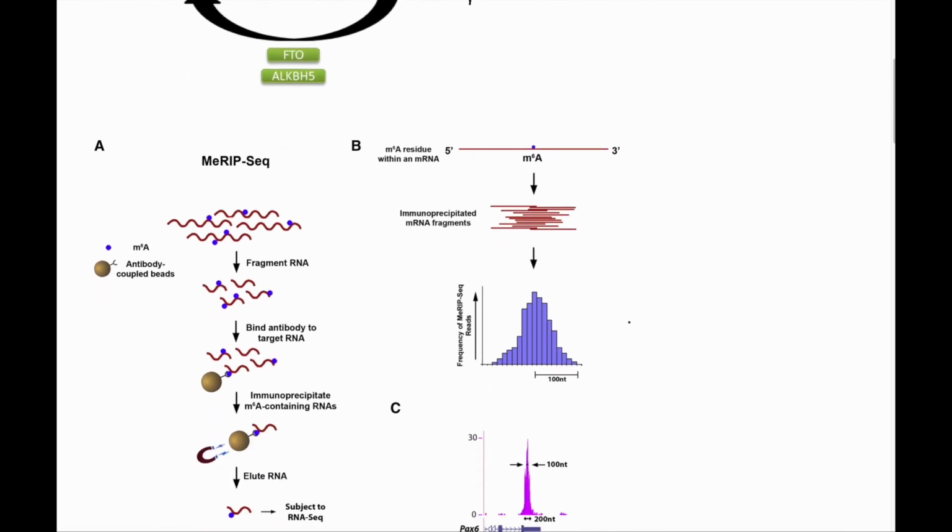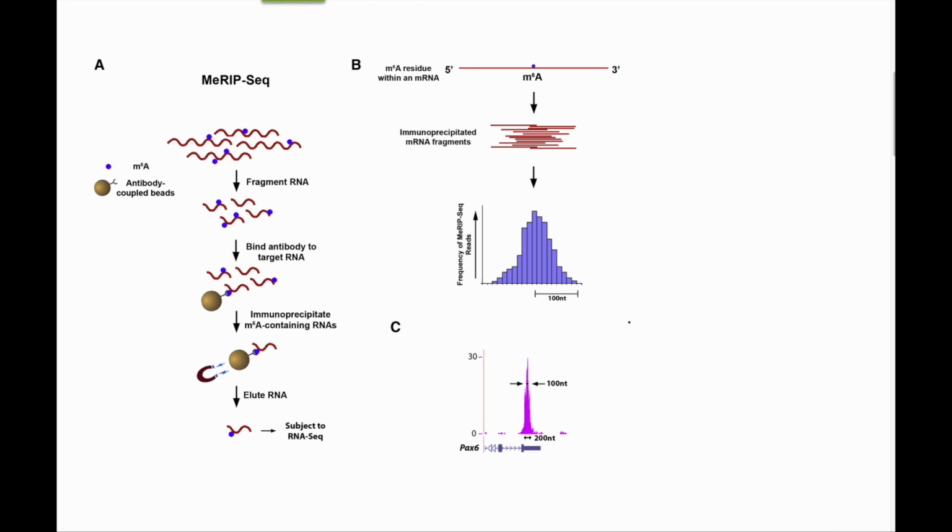Previously, before the advent of nanopore sequencing, m6A sites would be detected via short-read RNA sequencing methods. And there would be two particular strategies that were generally implemented in order to detect these m6A sites. The first is shown here on the screen, which is a workflow based on immunoprecipitation, where an antibody would be utilized in order to detect m6A sites.